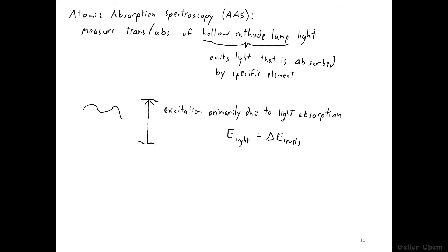So this is the theory behind an AAS experiment. As for what we do with it analytically, a perfectly good option is potentially to just use a calibration curve. At this point, we're just looking at Beer's law. As the concentration of absorbing atoms increases, so too should the degree of light absorption. And we can make a calibration curve with standards, plug in our unknown, solve for concentration.